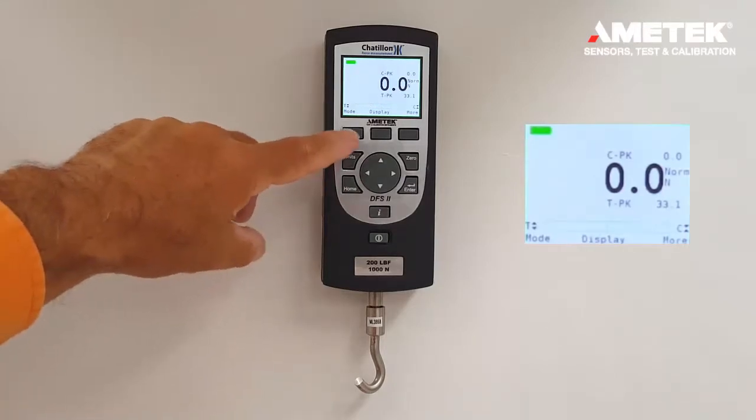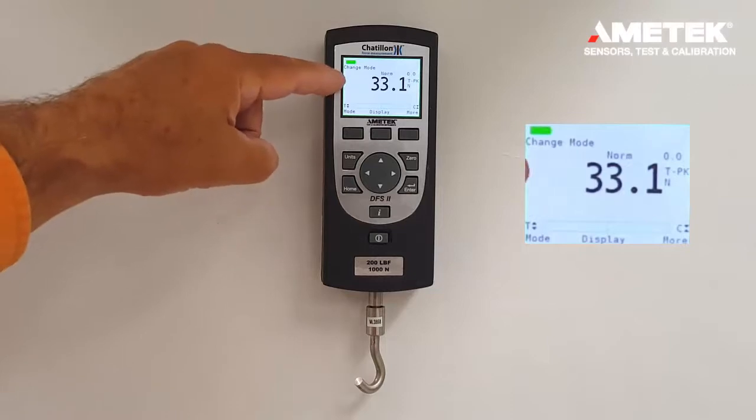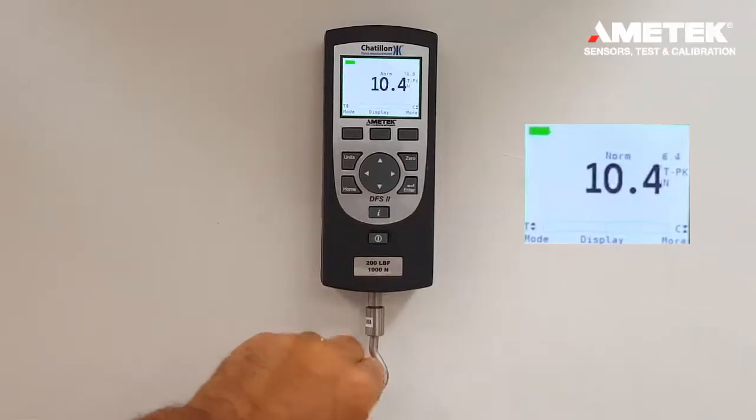Now, we can reverse that by pressing the mode button. Now, we display up front the peak value and in the background the normal force values.